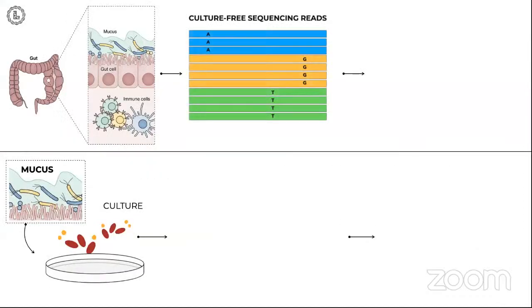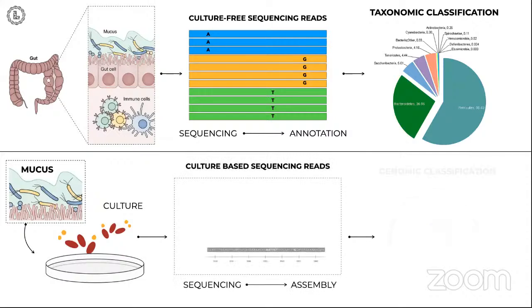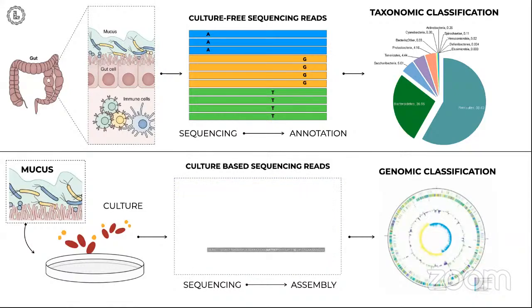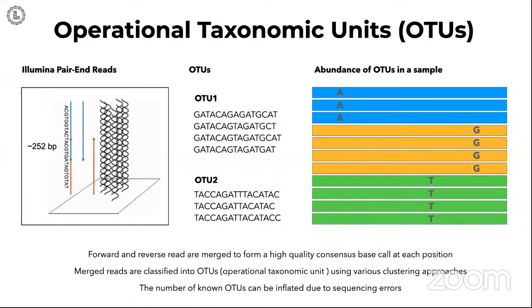And so here you can see an example of two ways of studying the microbiome, either looking at operational taxonomic units so that we can characterize the composition, or culturing and still using sequencing to understand what amount of different areas on this genome are being produced. So we'll talk about these different ways of studying metagenomic data, and we will also learn how to prioritize different hypervariable regions in the metagenomic sequencing data so that we can accurately detect how different communities that have not all been annotated could still be studied for composition.